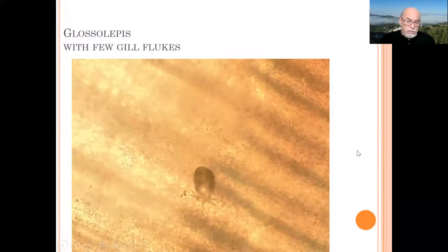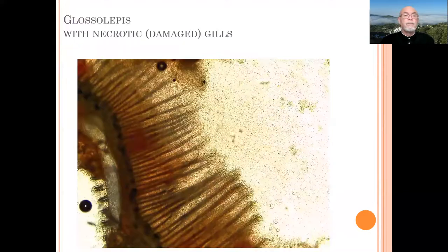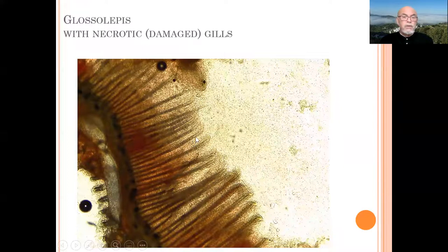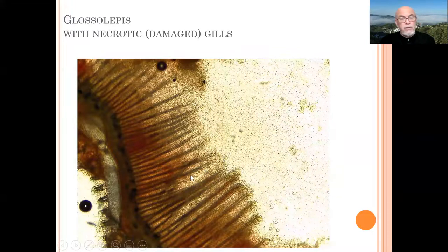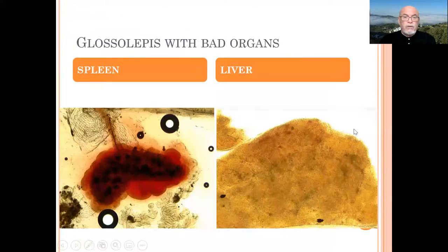That makes the gills very susceptible to serious bacterial infections, which can eventually kill the fish. Here is another gill arch taken from that fish, showing a whole necrotic patch where the gill lamellae have wasted away or been devoured by bacteria. This is already an advanced case. You can imagine the fish becomes skinny because it has no normal respiration — it becomes less hungry, has less appetite, eats less, and slowly wastes away.